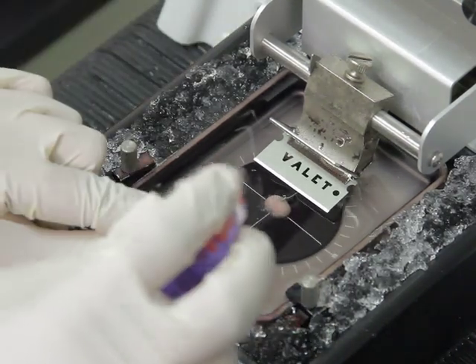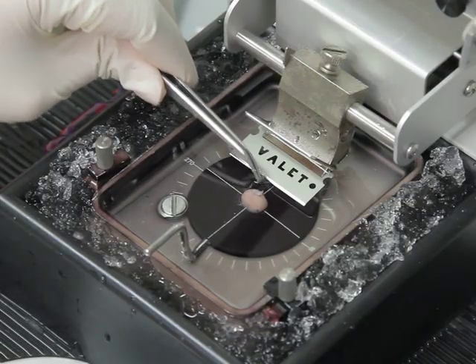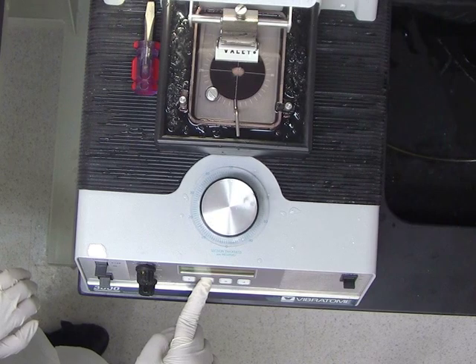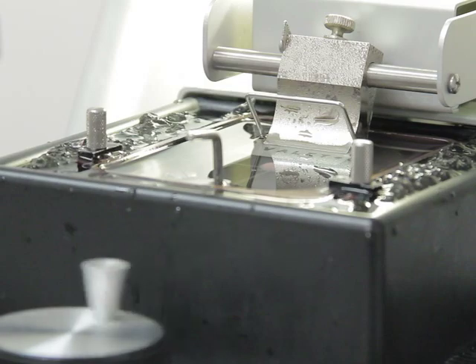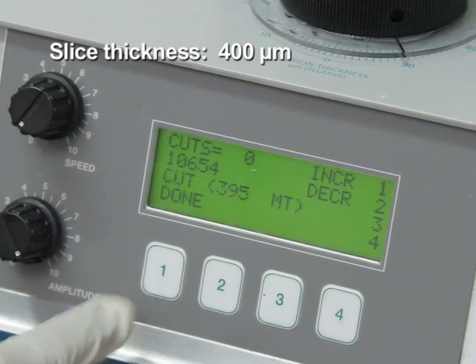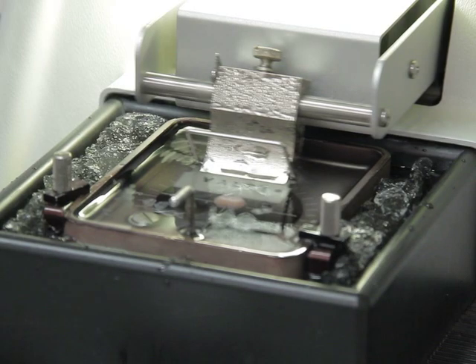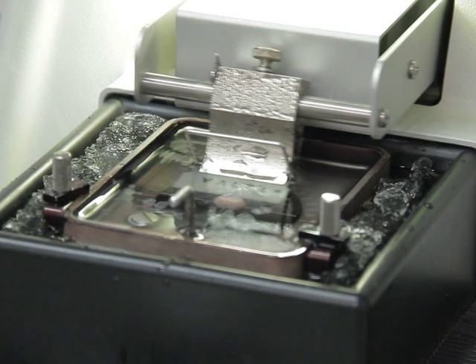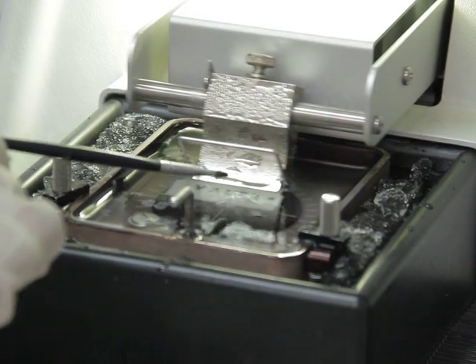Ensure that the brain is completely immersed in the sucrose ACSF in the chamber. After that, adjust the stage with the control so that the razor blade lines up with the top of the brain. Optimal parameters for the vibratome are obtained by setting the frequency and speed to low. Next, set the slice thickness to 400 micrometers. The first few slices usually do not contain the striatum; repeat the slicing until the slices containing the striatum are obtained.